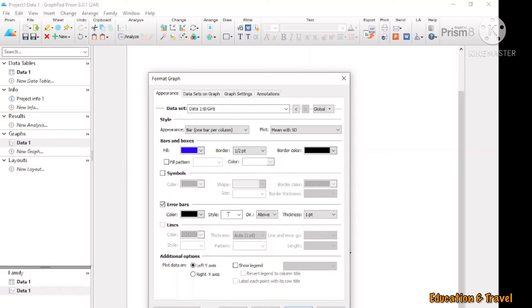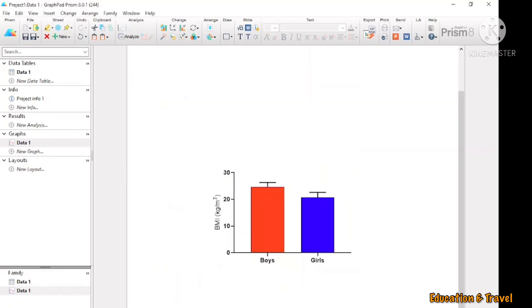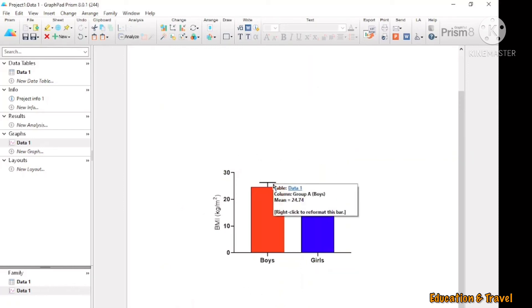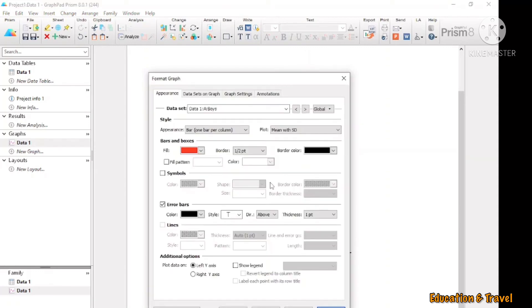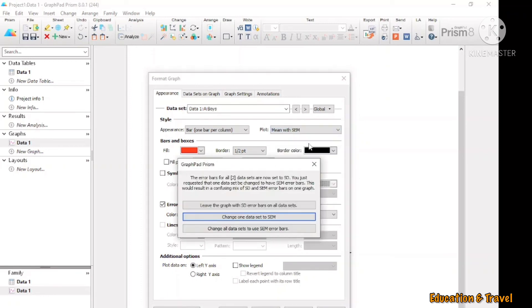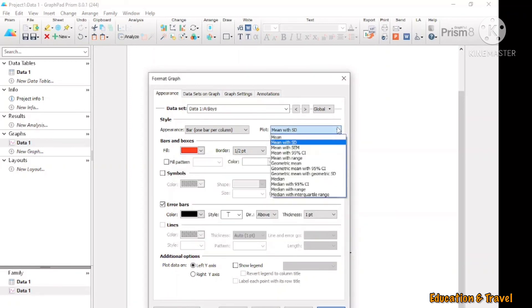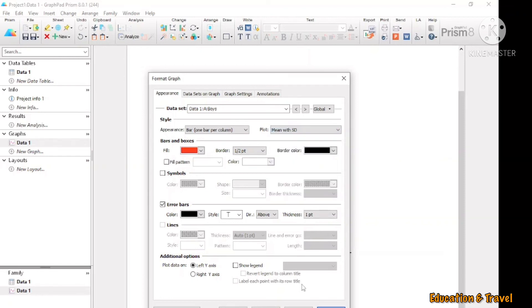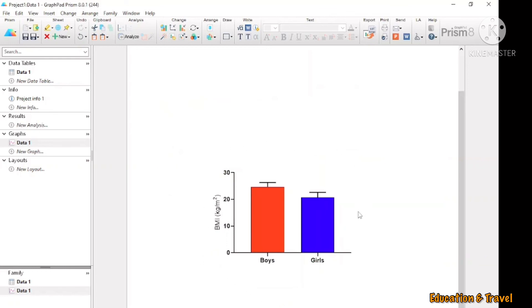Apply, then OK. This is the graph. In here, this is the error bar. If you double-click here, you can see it is set to mean with SD. If you want to use the error bar with the SEM value, you can click here, but usually we use mean with SD. Then click OK and Apply. This is the final graph.